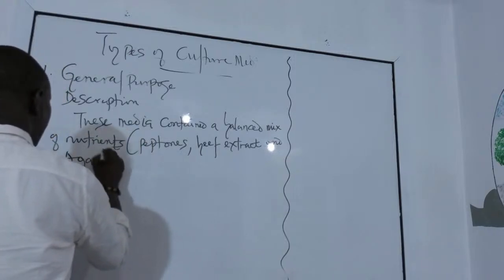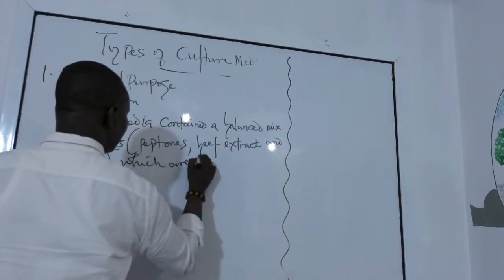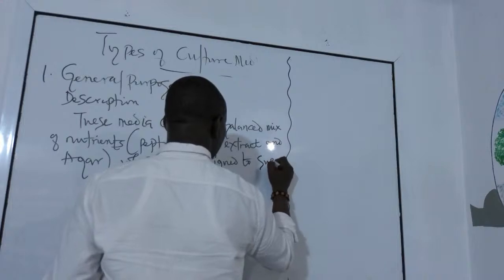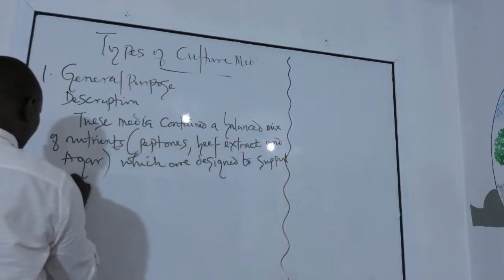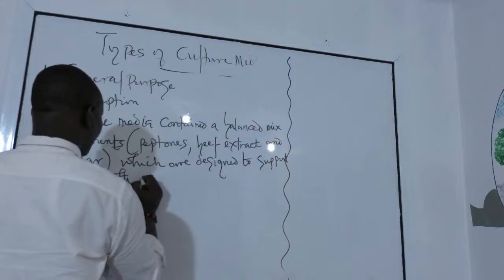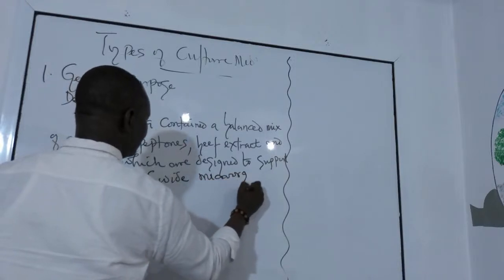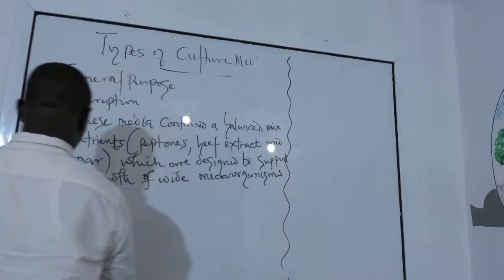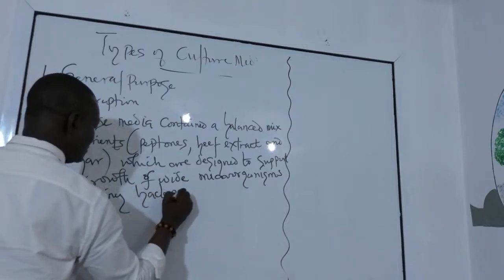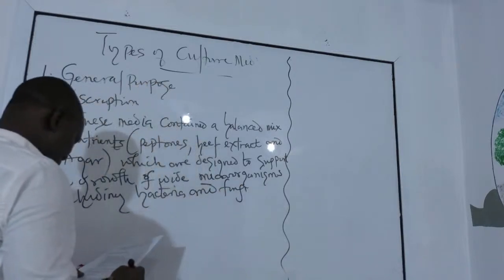Agar is the solidifying agent, which are designed to support the growth of general microorganisms, the growth of very wide microorganisms, including bacteria and fungi.